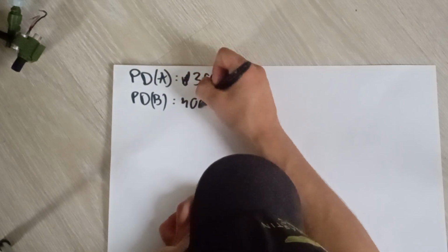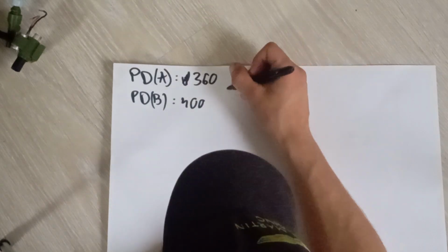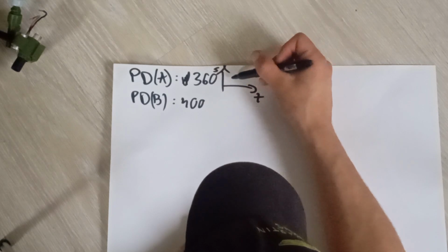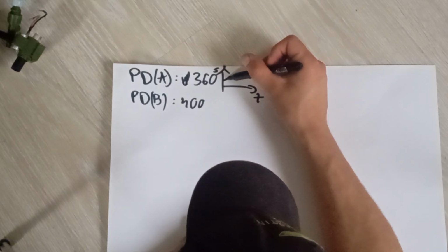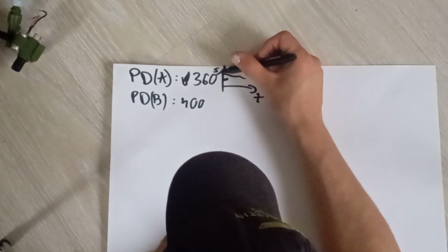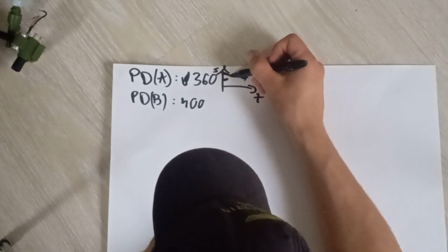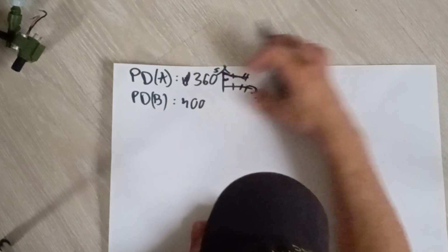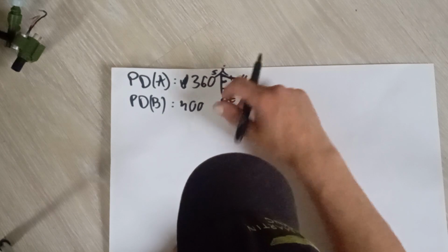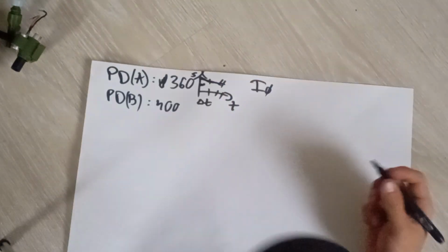Basically, when you start it, so this is time and this is the score, it goes up to this and then goes lower, then it stabilizes and flattens out. So there is some delta time here that you need to wait to be able to set the I0.